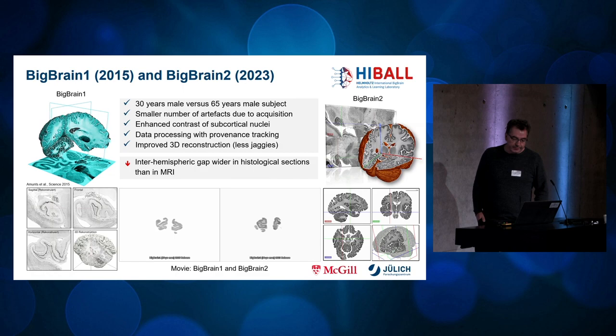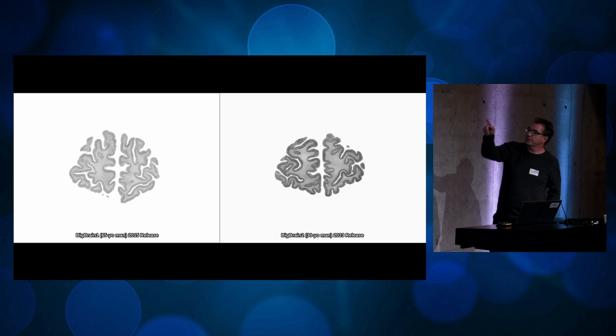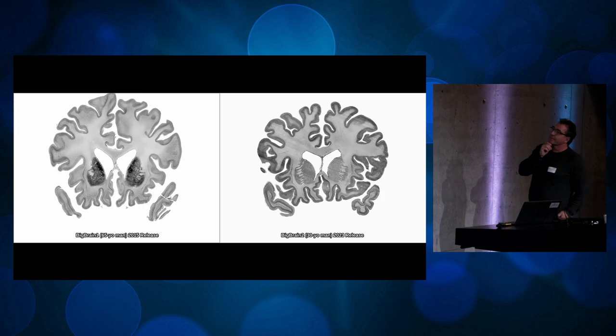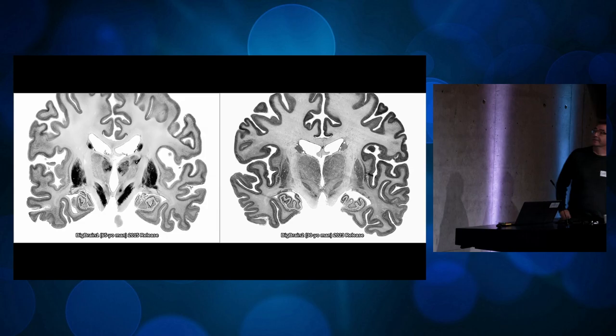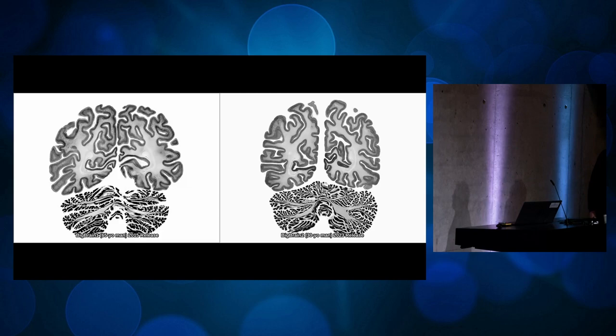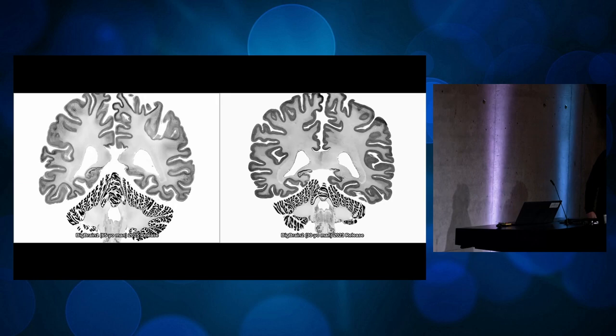Finally, I want to compare the BigBrain 1 dataset with the BigBrain 2 dataset. The smaller number of artifacts and the better contrast of the subcortical areas lead to an overall improved result of the 3D reconstruction. In this video, on the left side is BigBrain 1 and on the right side BigBrain 2. Please direct your attention to the subcortical regions — the contrast in BigBrain 2 is now much better than in BigBrain 1. The boundary of layer 1 is also much smoother, and almost all artifacts that are still present in BigBrain 1 are improved and corrected in BigBrain 2.